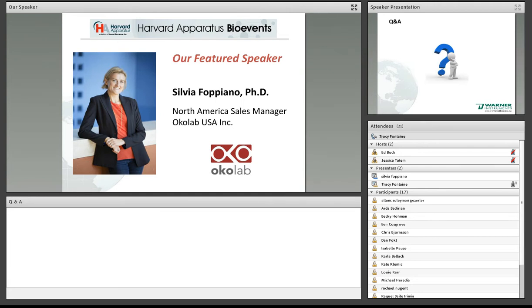For upright microscopes and a stagetop incubator, what is the working distance from the top to the sample? This is a very good question, and I don't have an accurate answer right now. It also depends on which objective you're using, but I'll be happy to put together some detailed information in the document that we will send out after this webinar with the answers to all the individual questions. I wouldn't want to give an inaccurate answer.